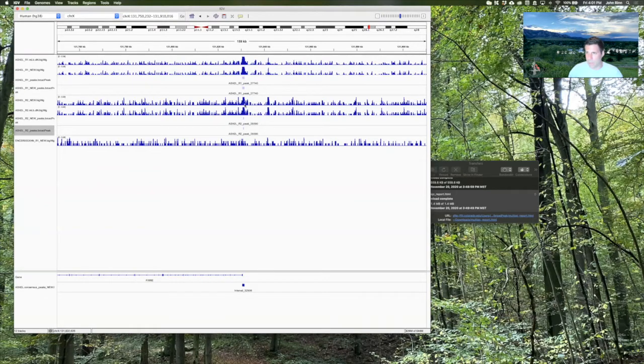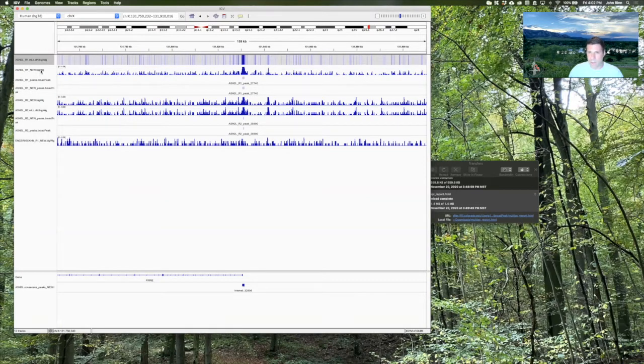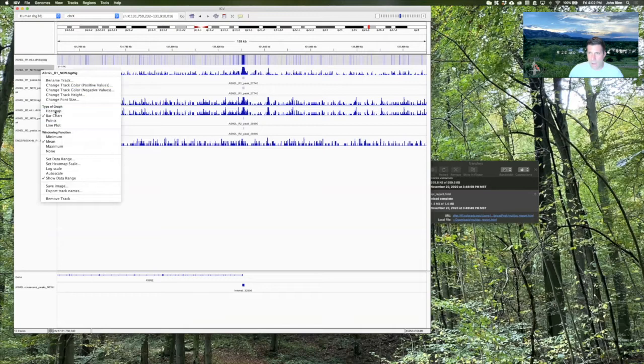Same for the second replicate, run on the old version and new version, and the peaks, and you can see the structure of the peak is not present in the input. I always like looking at the input to see what's going on. You'll also notice that IGV auto scales these tracks for you, so you can right click in the corner and change this to a heat map if you want to see the signal that way, shown here.